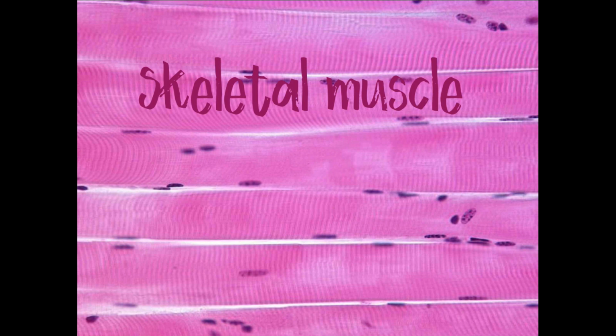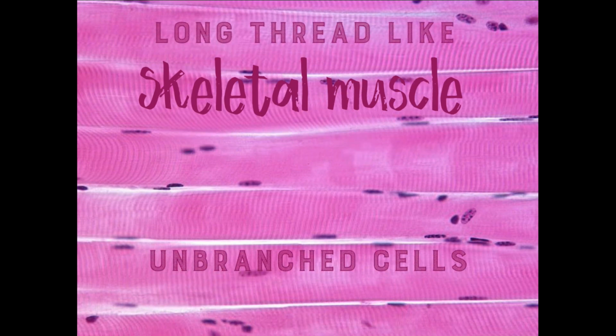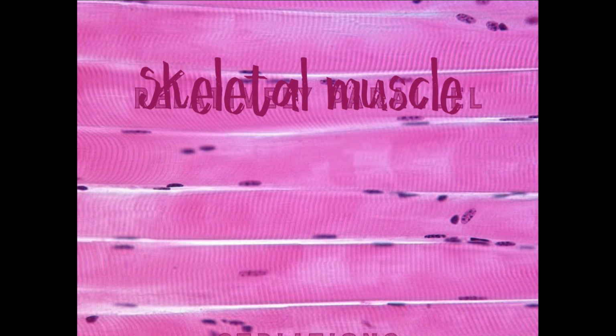So as we look at it in a microscope, one of the first things that you'll probably notice is the long horizontal sections. And each of those sections that's interrupted by the white space, which is a plasma membrane, is a muscle fiber, and you'll notice that they're long. There is no branching of it. It's just long thread-like muscle fibers. And as I mentioned before, it's unbranched, and they're relatively parallel. Not perfectly parallel, but for the most part.